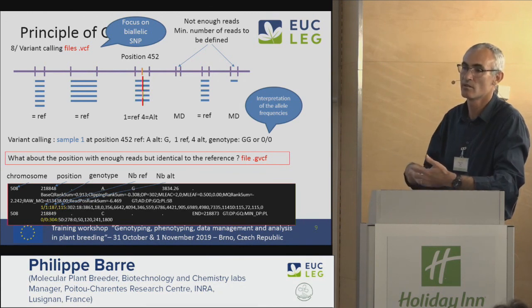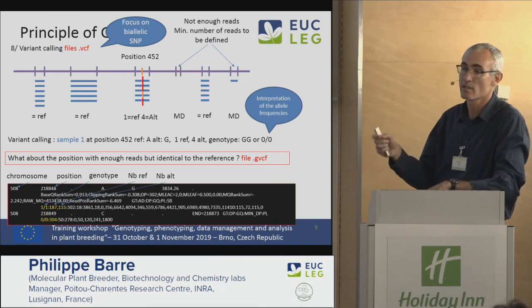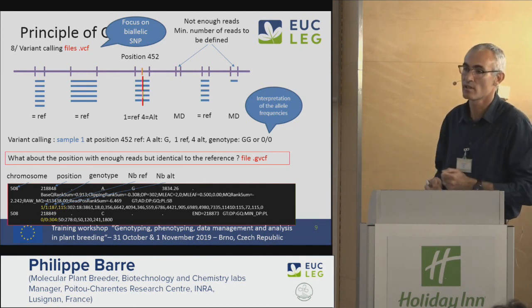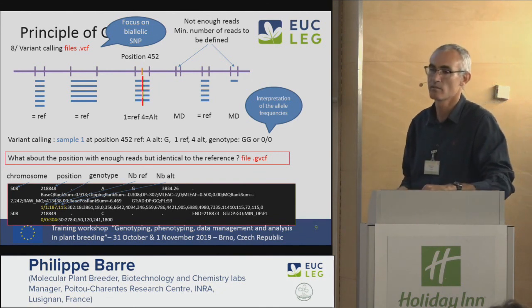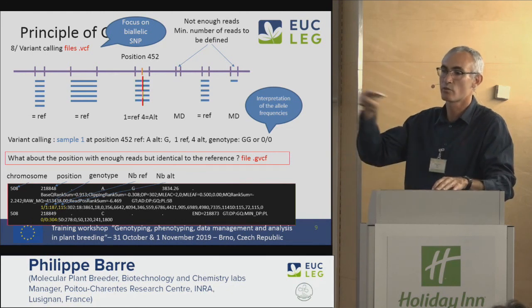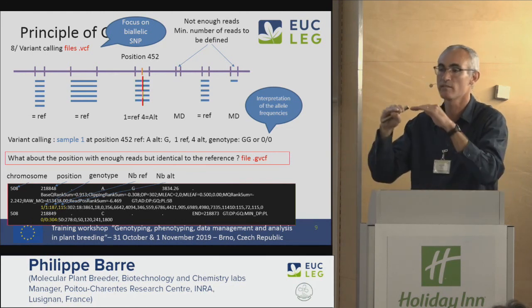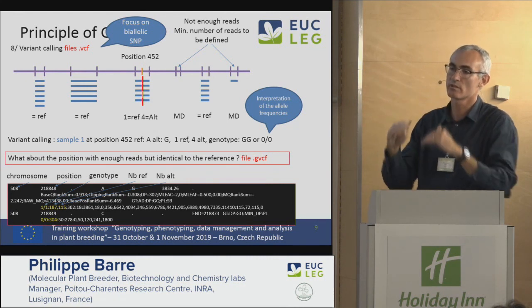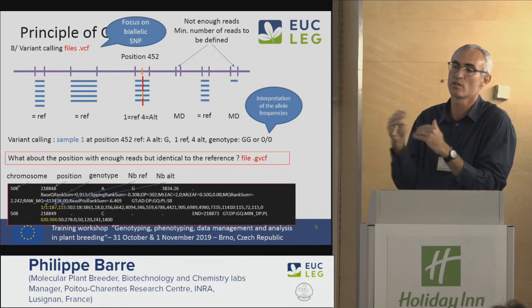In fact, it's a sequencing error. Yeah, okay. And so you don't know where to put the threshold of the sequencing error. So these differences can be due to sequencing errors, or other errors. But it's your background, and you want to put the threshold where your background ends, when you think it's not background anymore.